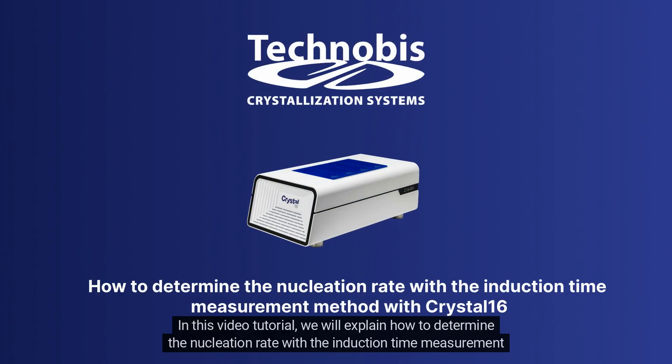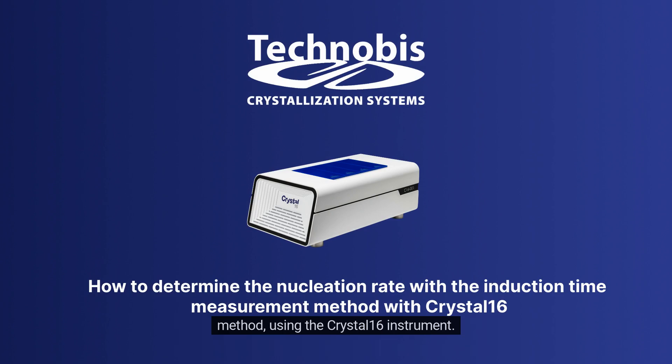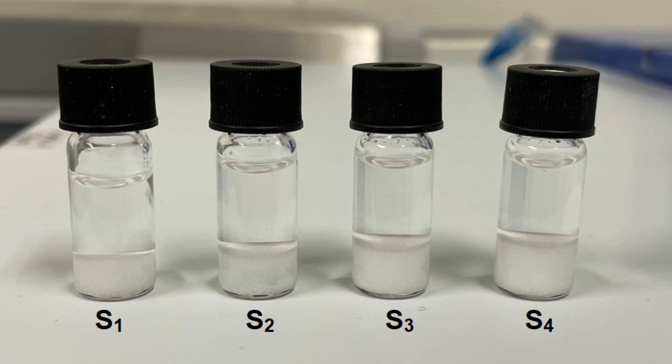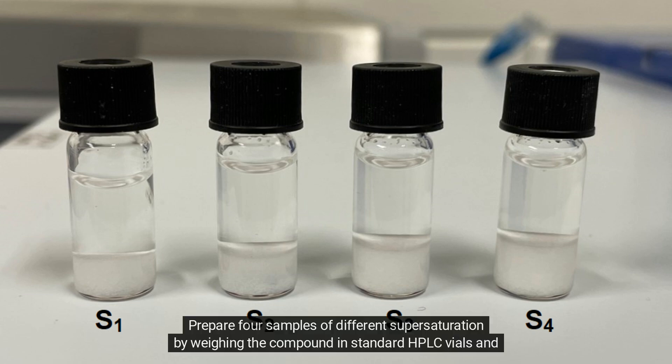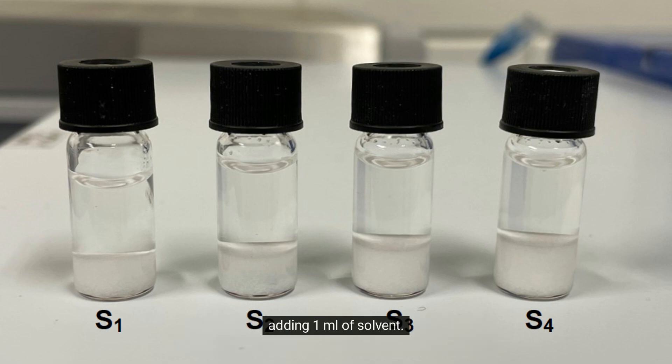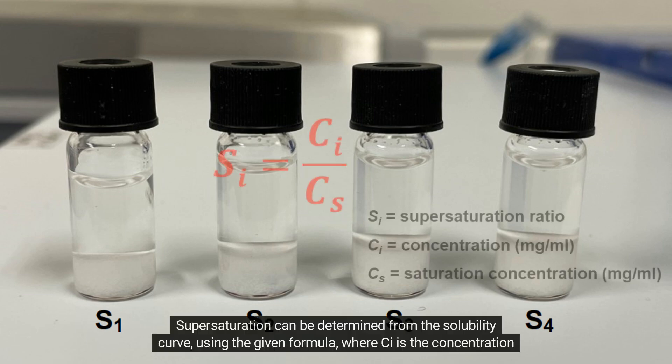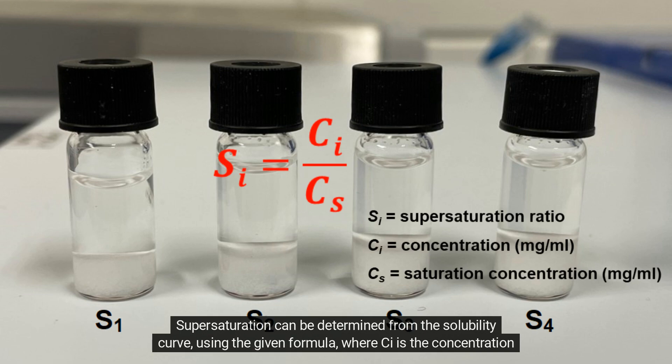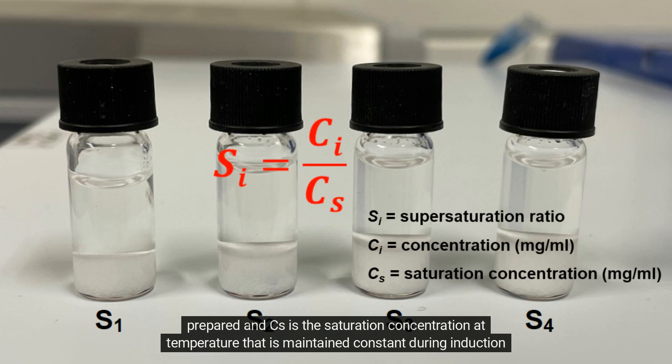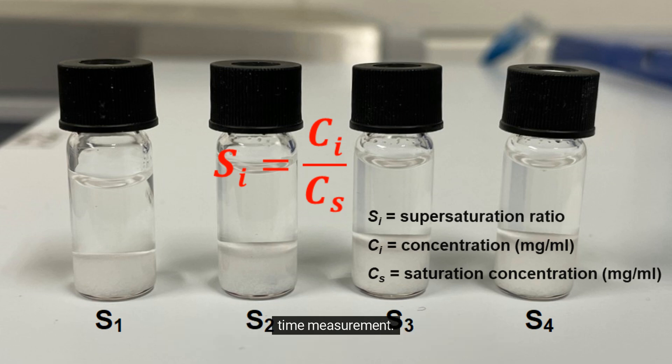In this video tutorial, we will explain how to determine the nucleation rate with the induction time measurement method using the CRYSTAL16 instrument. Prepare four samples of different supersaturation by weighing the compound in standard HPLC vials and adding 1 milliliter of solvent. Supersaturation can be determined from the solubility curve using the given formula, where Ci is the concentration prepared and Cs is the saturation concentration at temperature that is maintained constant during induction time measurement.